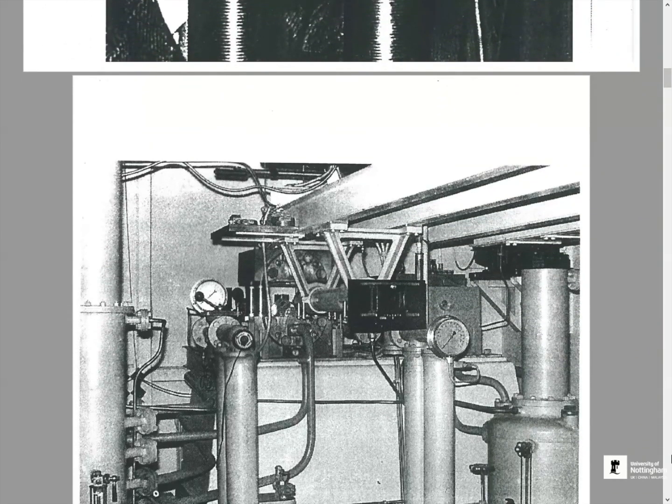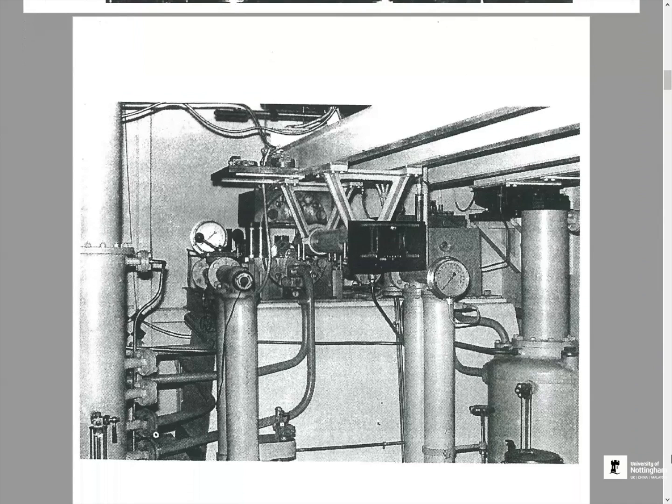And this is what an ultracentrifuge used to look like. I first visited the Svedberg laboratory in 1990, when I was invited over to give a lecture in Uppsala, and I went in to look for this instrument inside the room, the Svedberg centrifuge, and all it was, was the room.